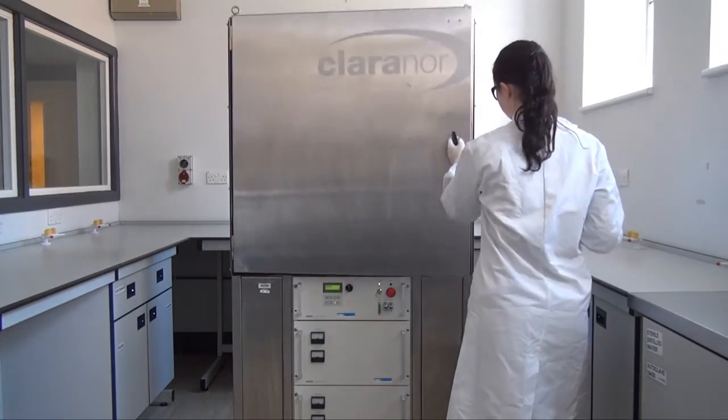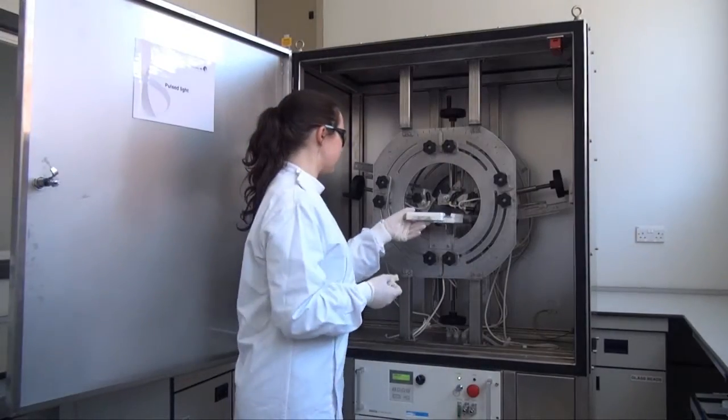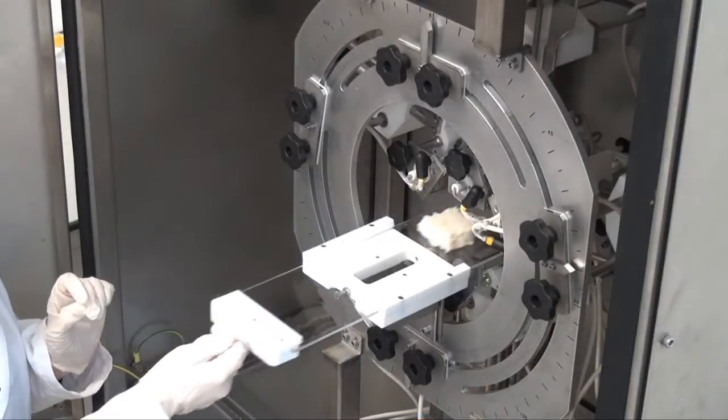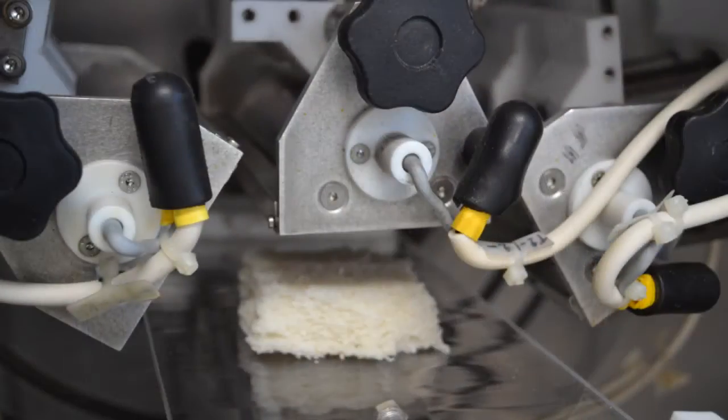A food sample is loaded into the treatment chamber to sit on a quartz UV transparent sample platform. The sample is surrounded by lamps.